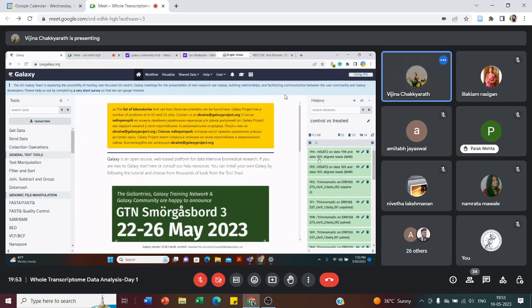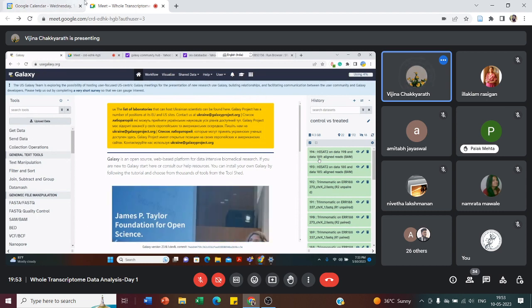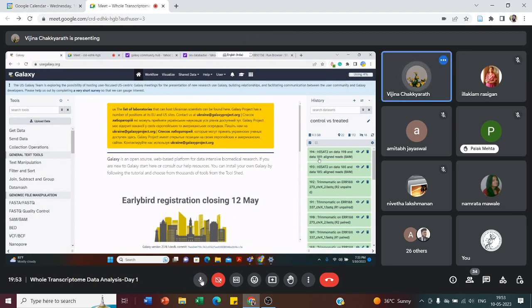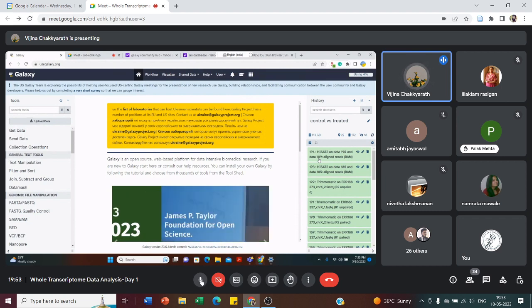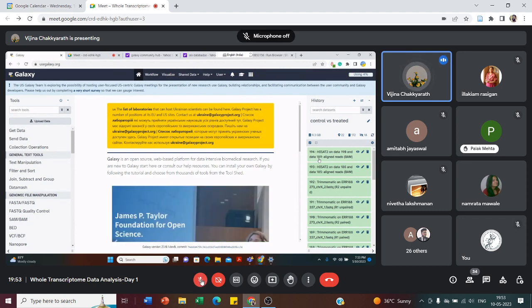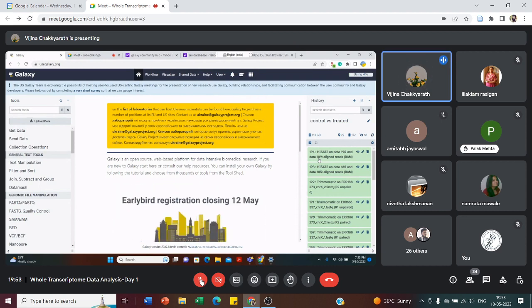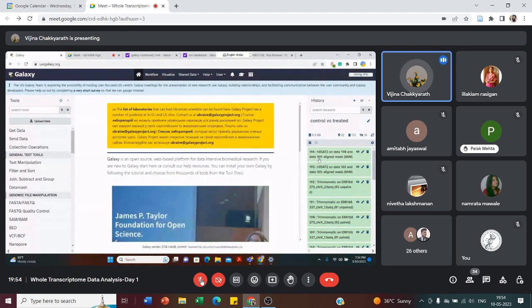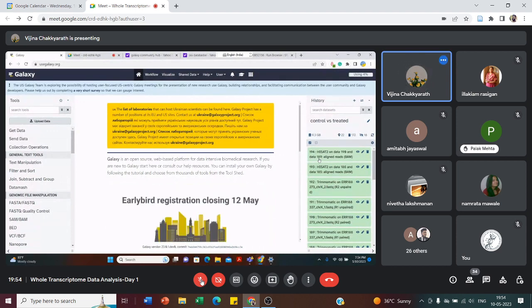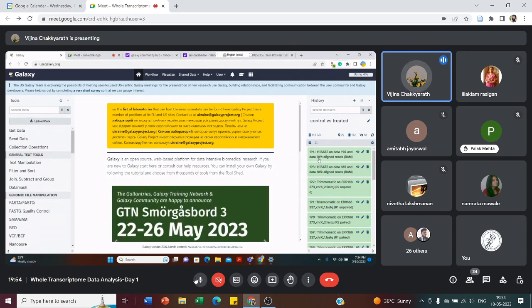Hello. Yes, ma'am, I think you just try to download that particular data. If it is not possible, you just message in the group. Then I'll say which data is good and which data you have to download, because that other data set I didn't try, so I don't know how it will be. If we go for SRA data, it also will take time.